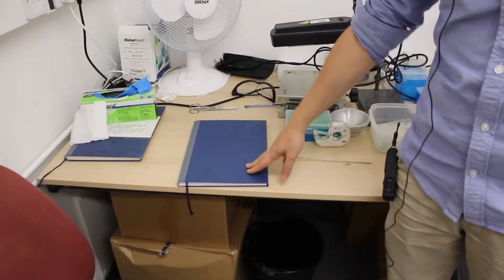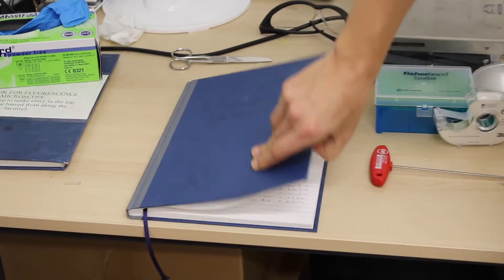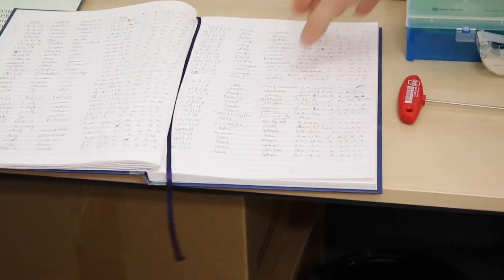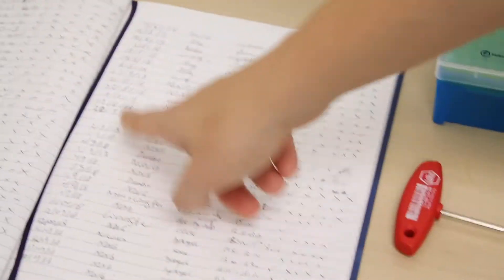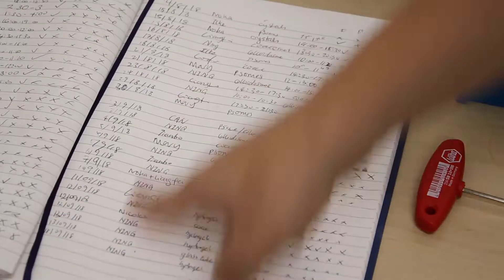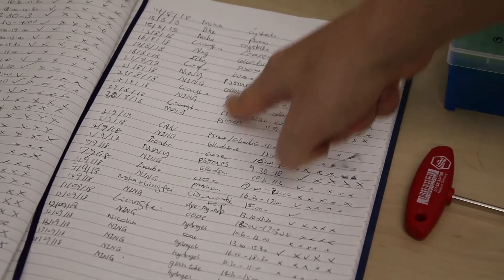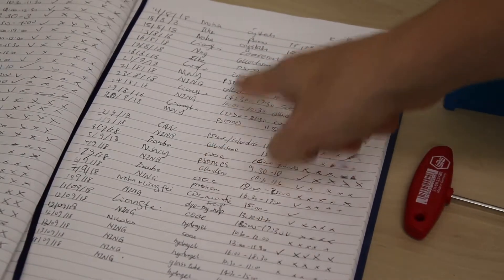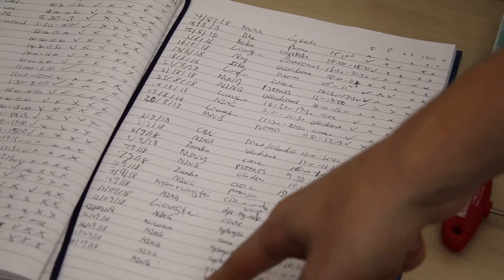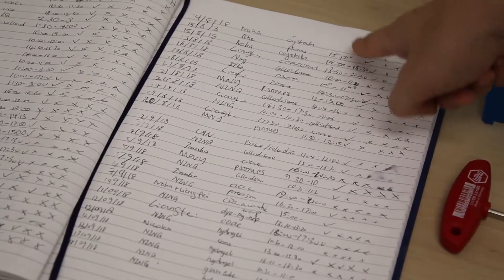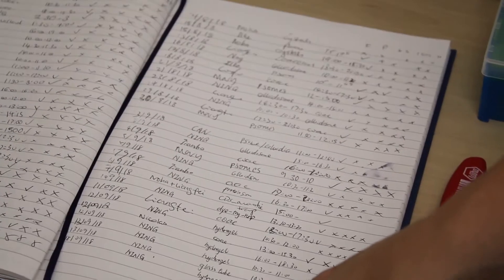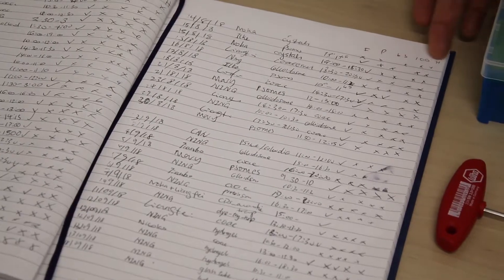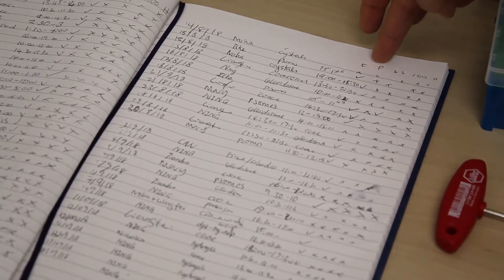Every time you use the microscope, you should log into the logbook. So in the logbook, there are different entries, so you would have to put the date, to put your name, to put what type of sample you've been observing, is it coacervate, proteinsome, gels, etc. What time you used it.